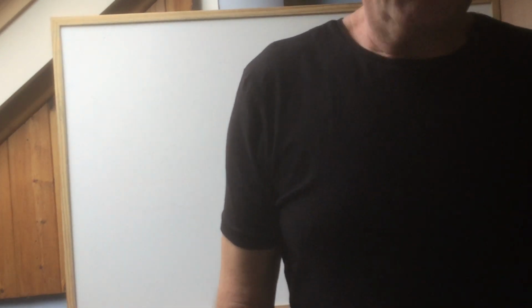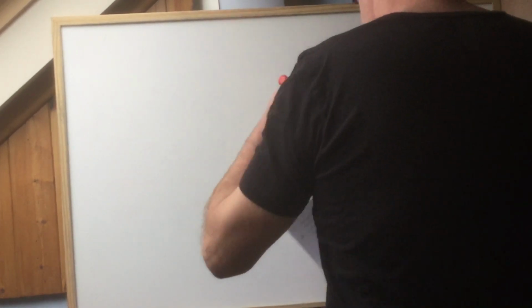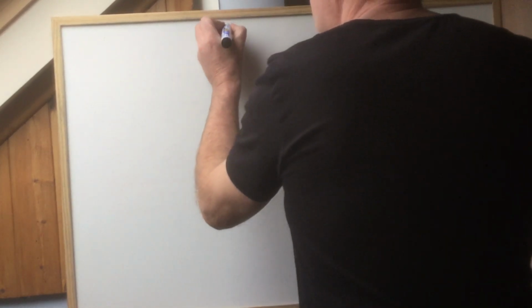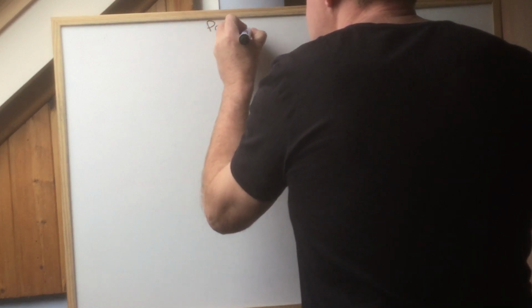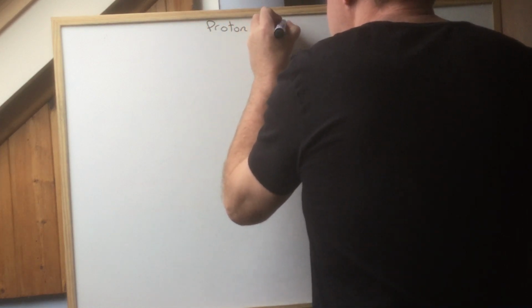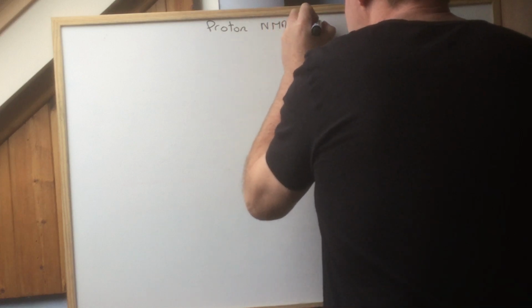Okay, so enough yap from me. I better get started. I'm dreading doing this because there's a lot to it, but we'll give it a go. So hopefully you can see me. I'll just check. Yeah, looks okay. Right, so title, I'm in the wrong colour already. Proton NMR Spectroscopy.